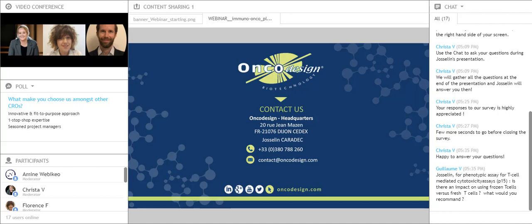We just have a question. We have one question coming up. Okay, so it was good to stay on the line. So the question, Jocelyn, is the following: phenotyping assay for T-cell mediated cytotoxicity assays. Is there an impact on using frozen T-cells versus fresh T-cells? And what would you recommend?